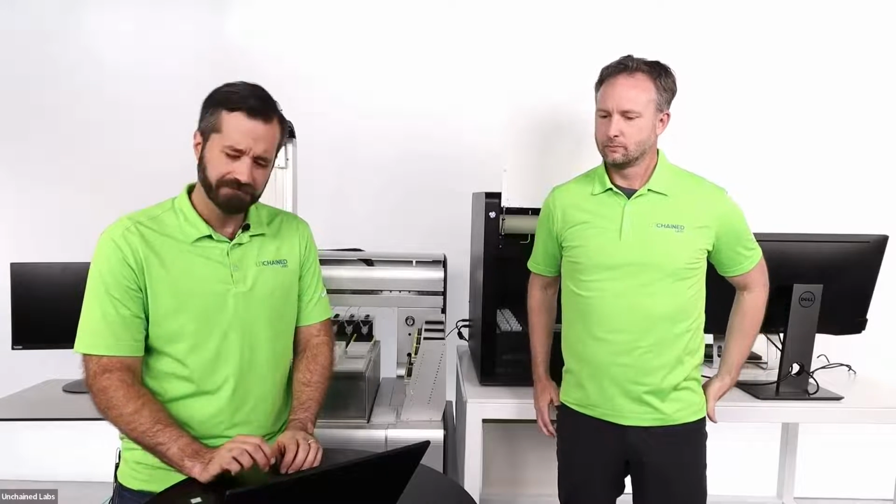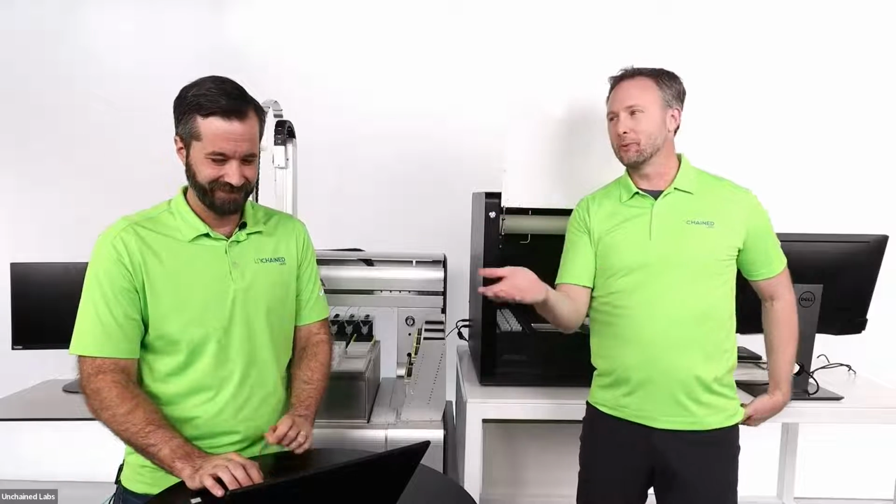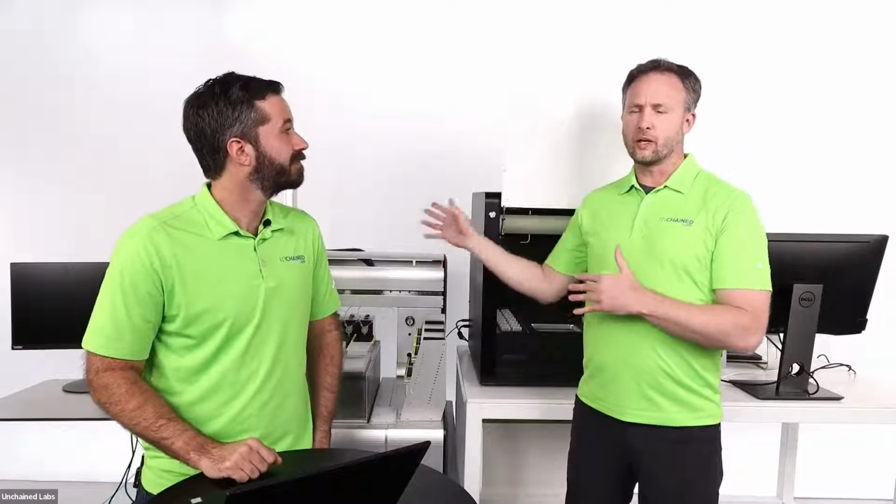All right, so the next one that we've got here is, can I put Unagi in a cold room? I mean, physically, yes, but no, we don't recommend that. It's not supported. I know there are a lot of questions around this, about, well, I have samples and I want to run them cold. We don't support that on either instrument.